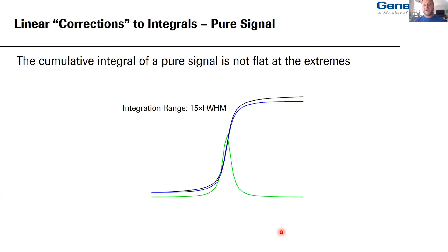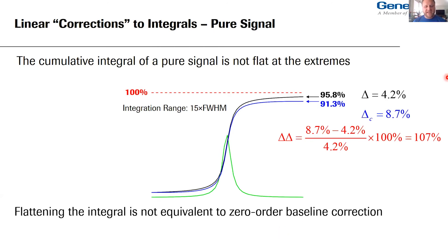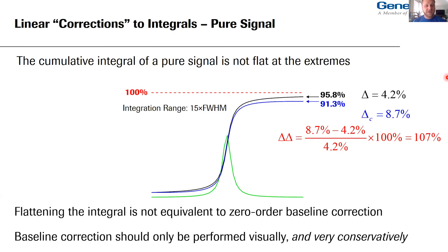Let's see what happens to the pure signal when we actually try to flatten something. With a Lorentzian singlet, no noise, full width at half maximum of one hertz, integrating to 15 line widths, if we do a subjective linear correction it looks nice and flat. But that represents 100% of the under-integrated integral, which was just shy of 96% of the area. Now the flattened integral takes another 5% away from the true answer — going from a bias of 4.2% to a measurement bias of 8.7%, a relative bias change of 107%. Flattening the integral is not equivalent to a zero-order baseline correction.